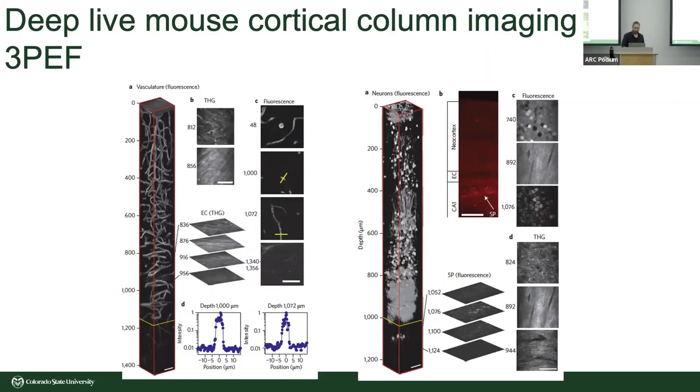So the microscope exists. For those of you who are interested in using it, many of you know, and this question comes from somebody who I know knows this microscope exists. This is a system that's been around in a research lab on campus for about a decade. It's only now that we're folding it into the core facility, for reasons I'm happy to discuss offline at any point. The microscope will be available starting in November through iLab. So just like any other system in the Analytical Resources Core, you can go online and request service. That email will come to me. We'll discuss your application space. We can train users, and you can book time on the instrument. So that's how we access it.